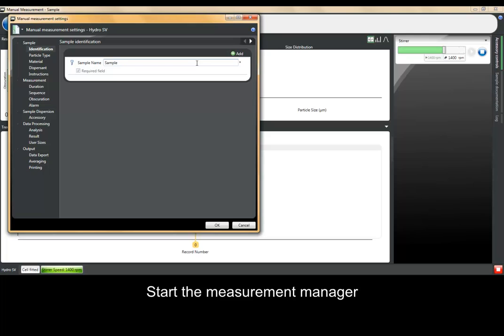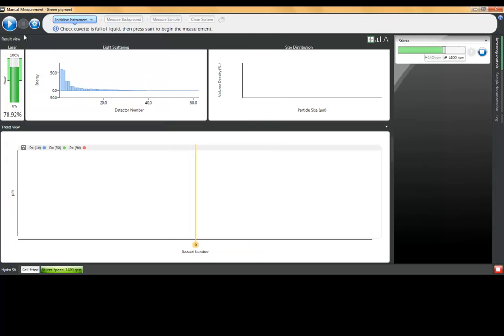And then we can start the measurement process. In the measurement manager, the first thing we will do is add some sample details. In this case we are measuring a green pigment sample.